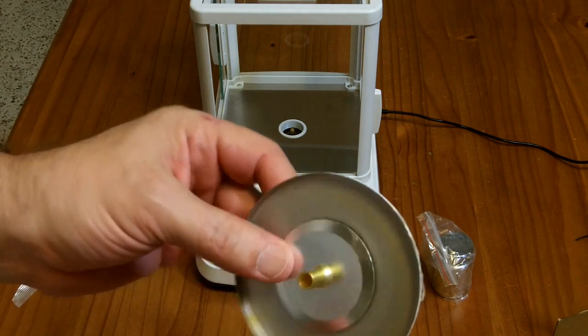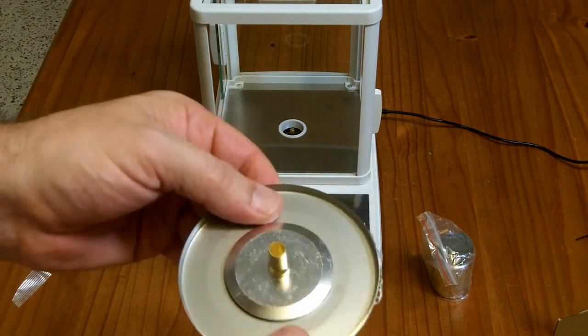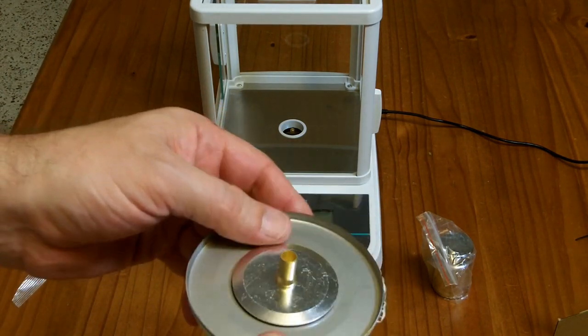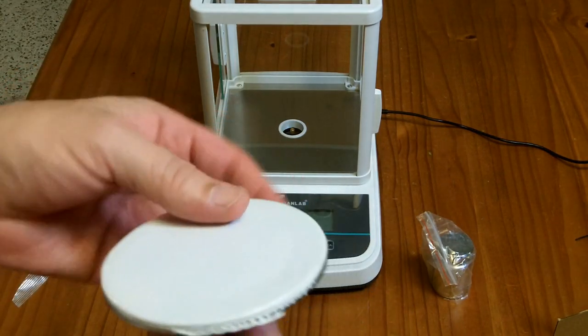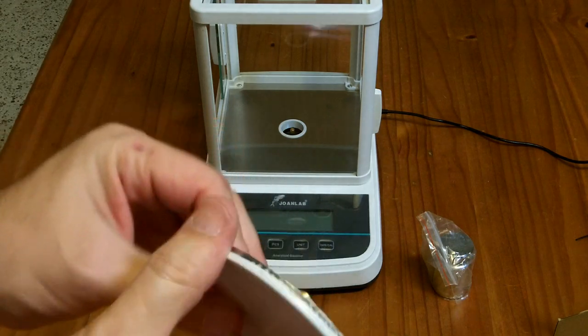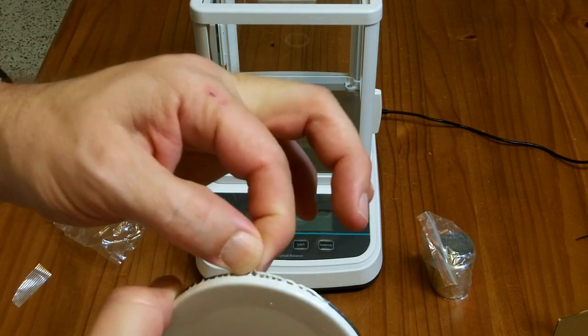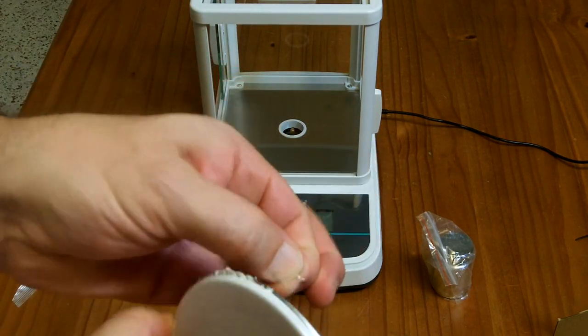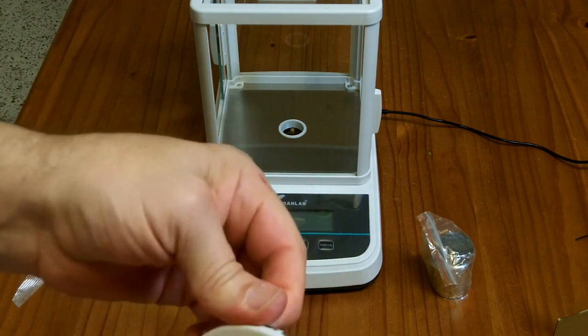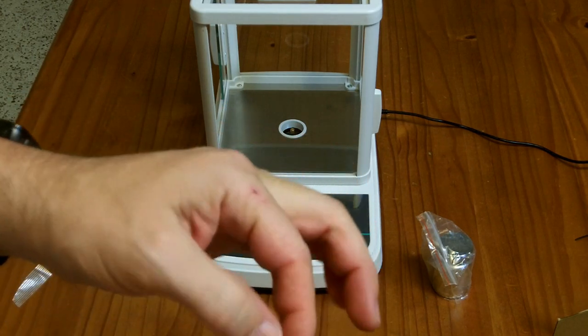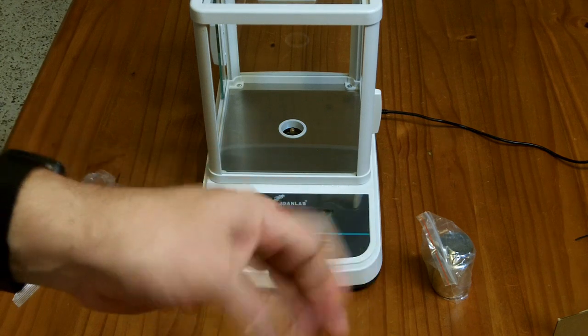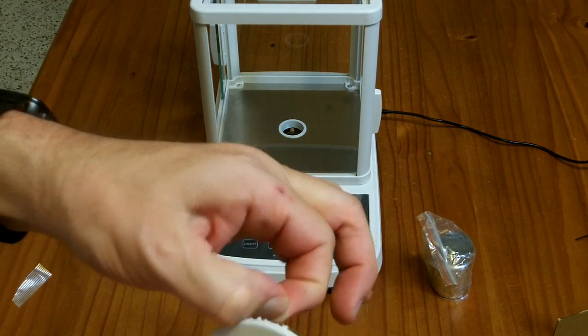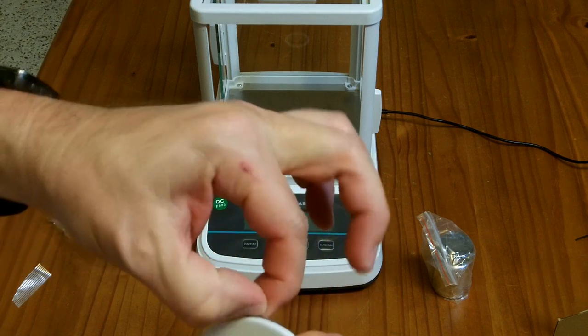So this little balance area here is basically just a piece of stamped aluminum with a kind of a stand on the bottom of it. And it looks like there's a vinyl wrap, you know there's some edges here that are a little bit teary still with white vinyl on the top of this thing. So I'm ripping some of these off and I don't know if it's going to auto calibrate to the new weight here or how that's going to work.